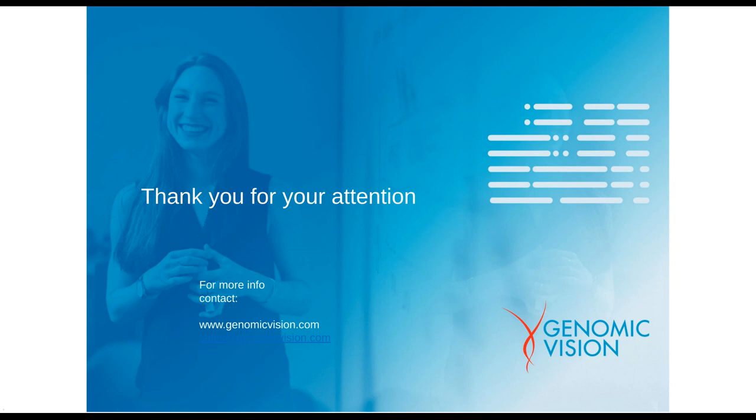Another question that came in: other than detecting mutations, can this method be used to view certain alleles in chromosomes to detect certain genetic diseases, such as color blindness or hemophilia? That's a really good question, because using our characteristic GMC, we probe the DNA.